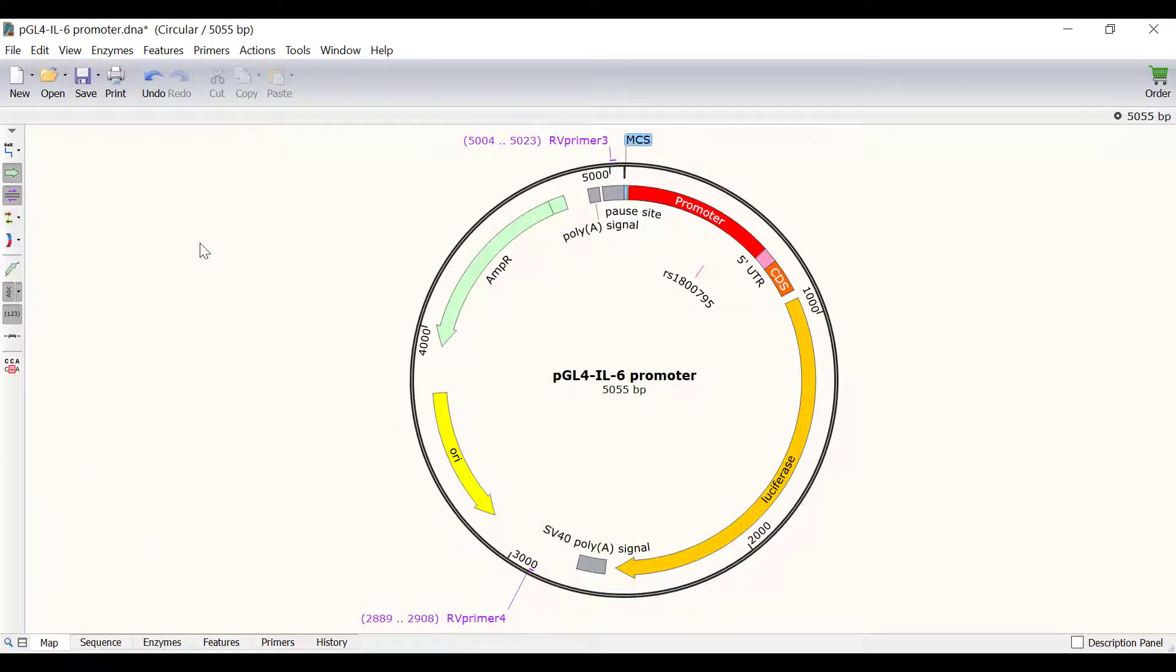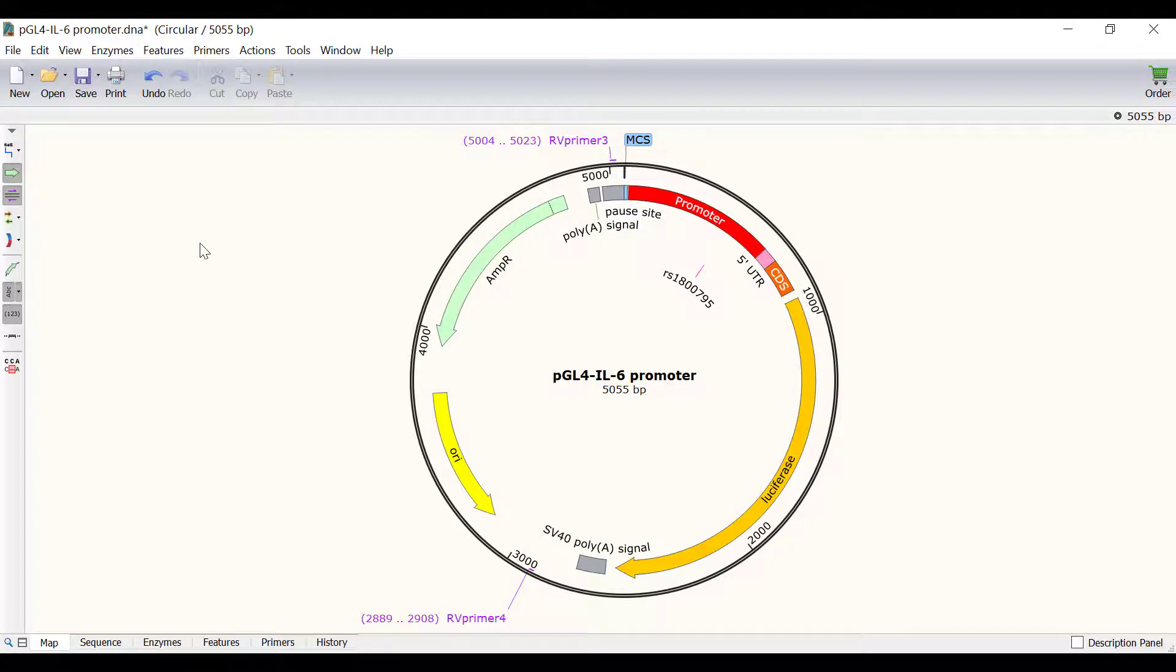To demonstrate this, I have a file open containing a PGL4 plasmid with the interleukin-6 gene promoter region.